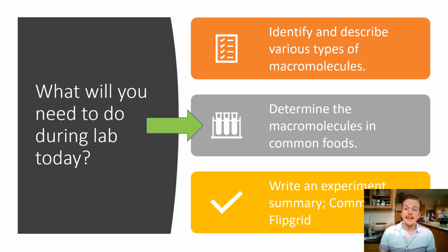So today in the lab, you're going to be watching a video of it because we're doing a virtual lab. But we're going to go through the procedures because even though this is a virtual lab, in the future you may be taking in-person labs and you'll need to know some of the lab safety and precautions and reasons why we do things in lab.